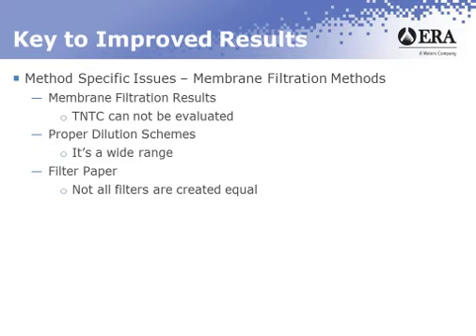You may see brittleness in the paper. When you do your initial evaluation, you may see decreased recoveries in what you normally see for that quantitative challenge that I talked about earlier. You may get wrinkling on the paper. You may get areas of the paper where you get absolutely no absorption of your media.